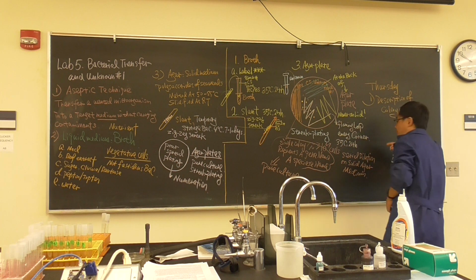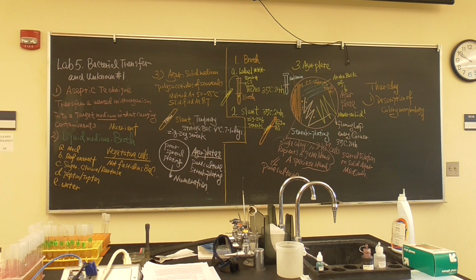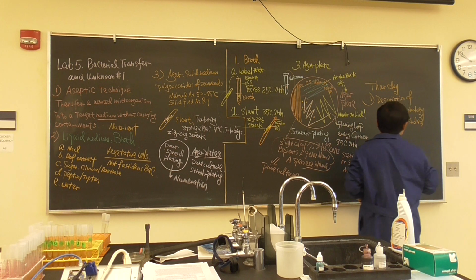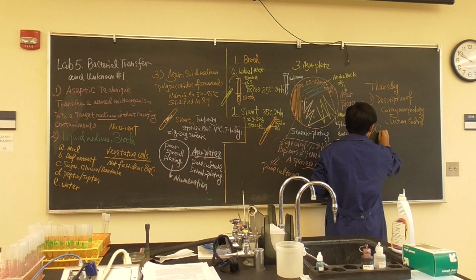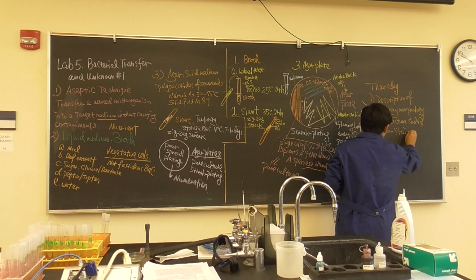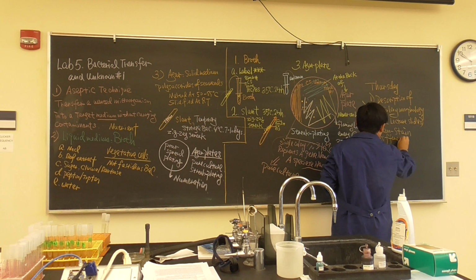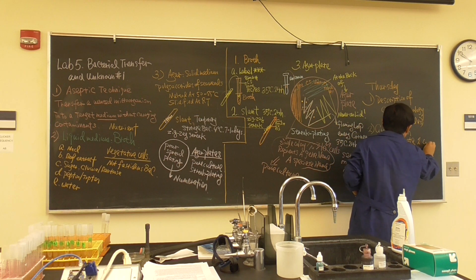the colony morphology will be in the slides of your lecture. So I will be mentioning this. This is in the lecture slides. I will try to print it out for you, but it won't be in color. Second is Gram stain, to differentiate the two colonies.